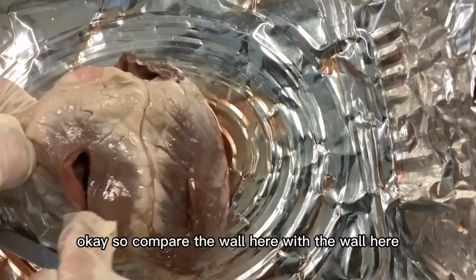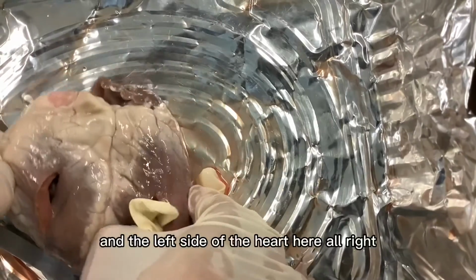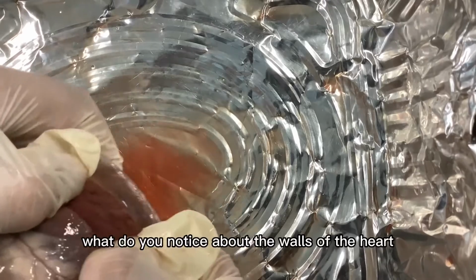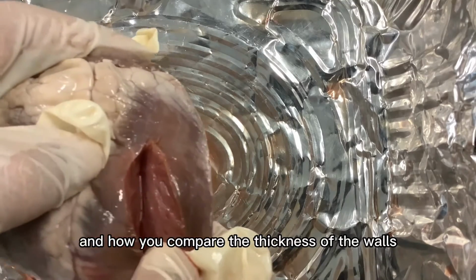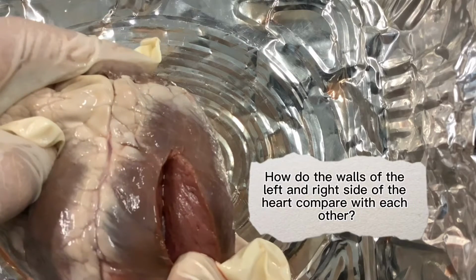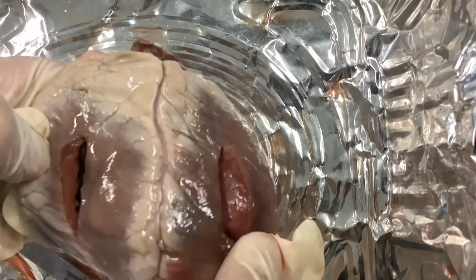Okay, so compare the wall here with the wall here, being the right side of the heart and the left side of the heart here. Alright? What do you notice about the walls of the heart? And how would you compare the thickness of the walls of the heart between the right and the left sides? Alright, so you probably would have noticed that the left side of the heart is much thicker than the right side of the heart. Alright?